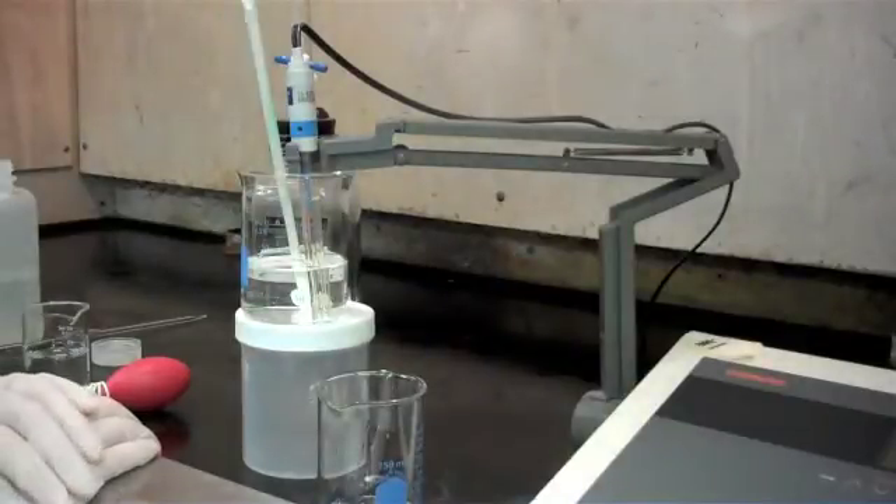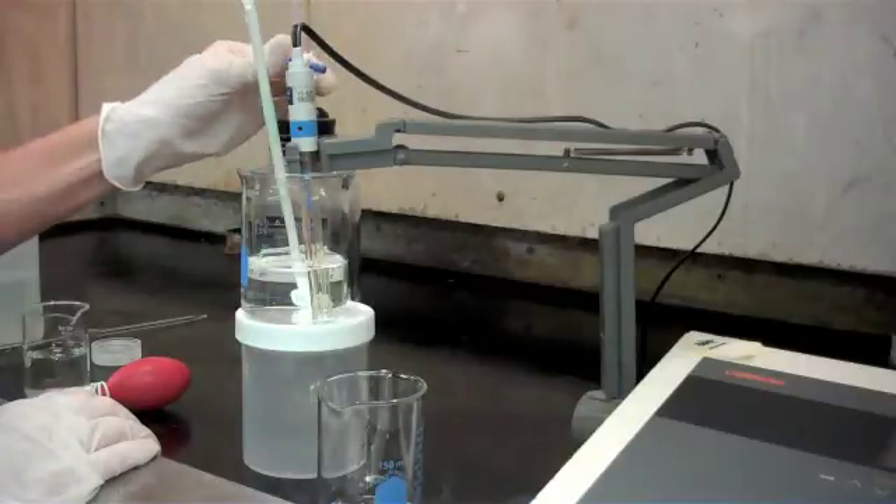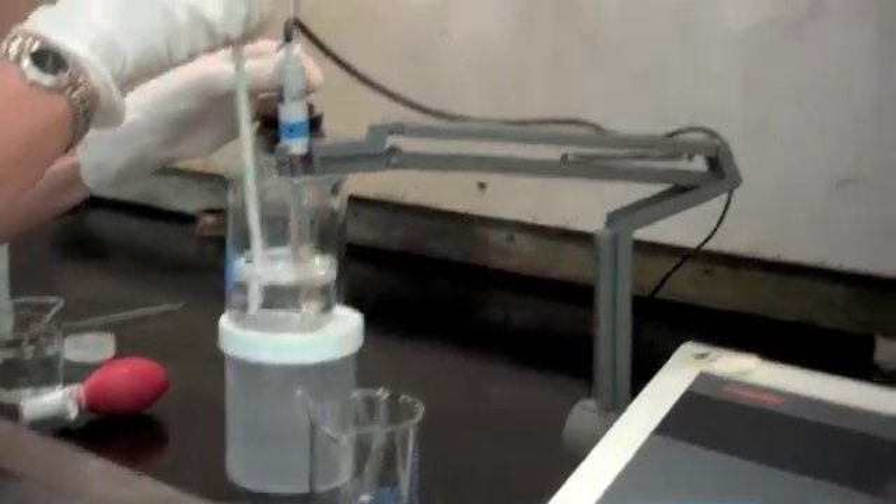Now we're going to continue titrating up to a pH of 8.2. We're not going to re-zero the burette — we're just going to continue our titration from the 2.5 ml that we've already used, going up to a pH of 8.2.